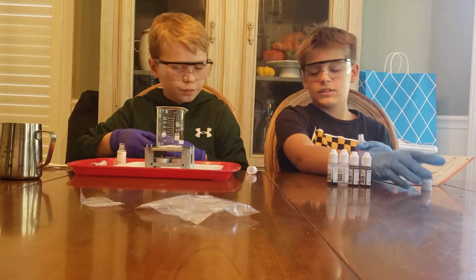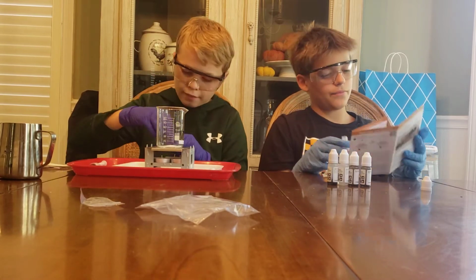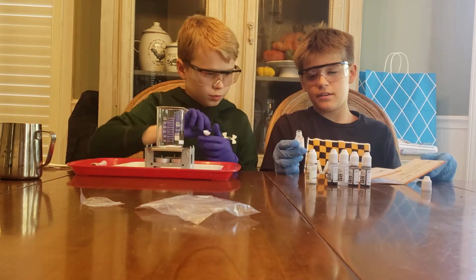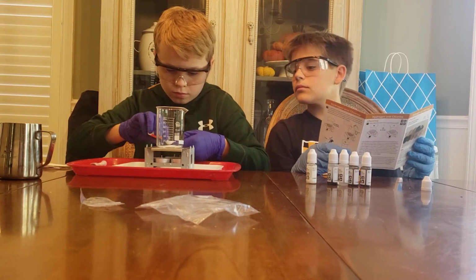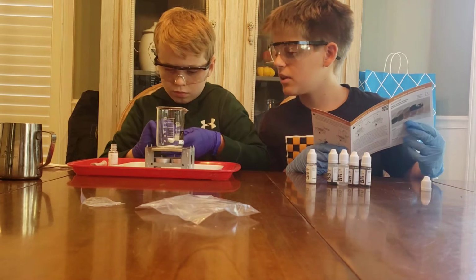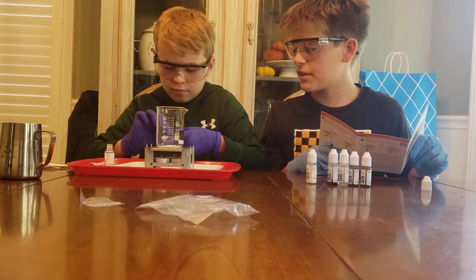Okay. So now that he has one big spoon in it, put sodium hydrogen sulfate, one big spoon, in the flask. Probably a little bit more. Okay. That's good. Yeah, that's perfect.